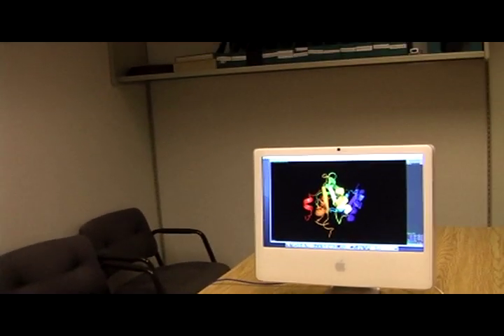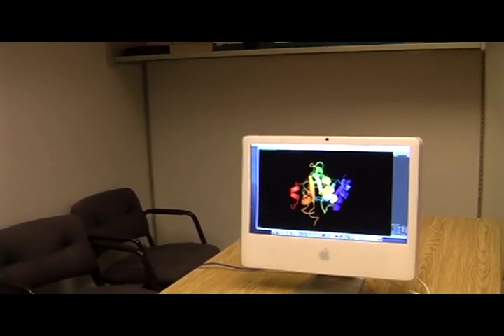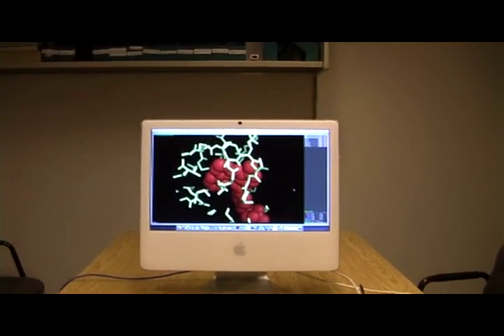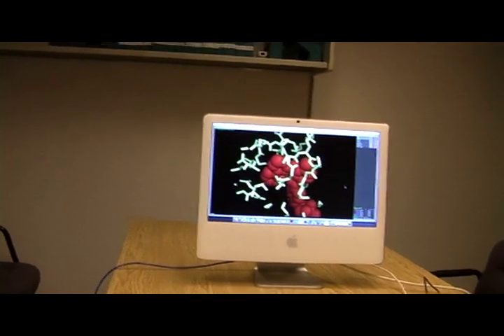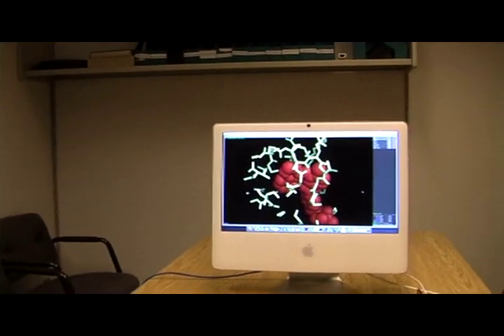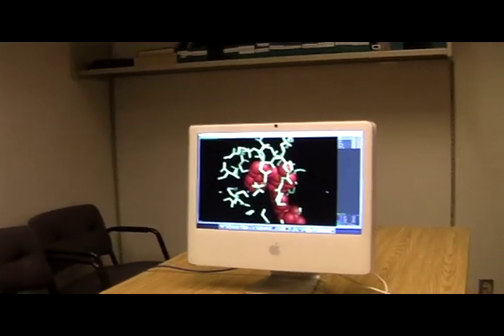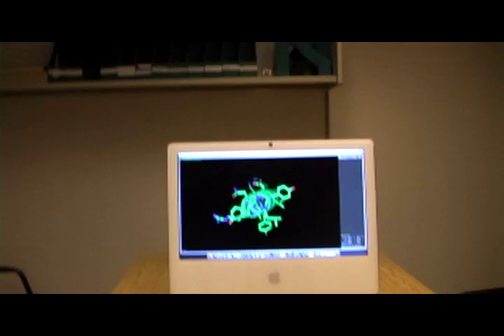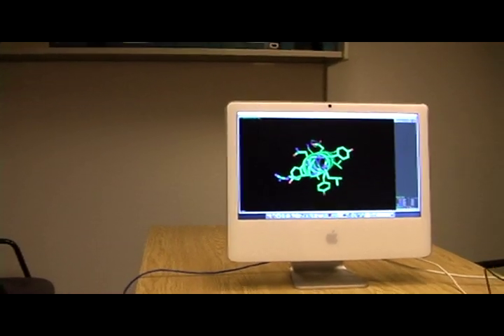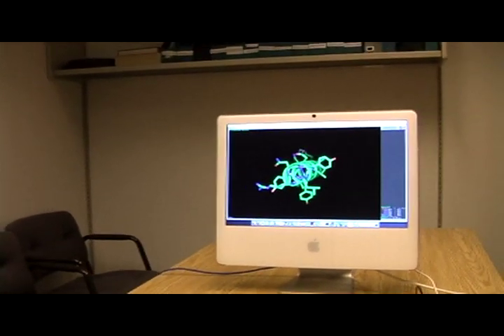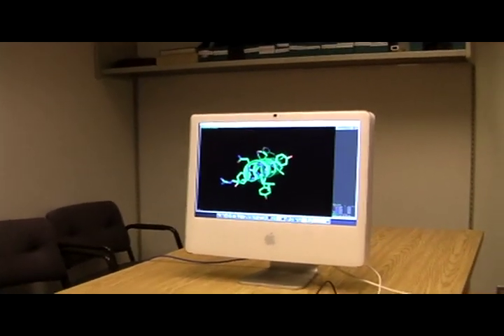Looking at a drug complex, we can see how this form of input can provide a useful experience to biologists. Allowing the user to physically examine the molecule from different angles provides a much better interaction and interpretation of the molecular data. Finally, for the IR form of input, we see here an alpha helix. Since we don't have a Steadicam at our disposal, much of the effect is lost during the filming.